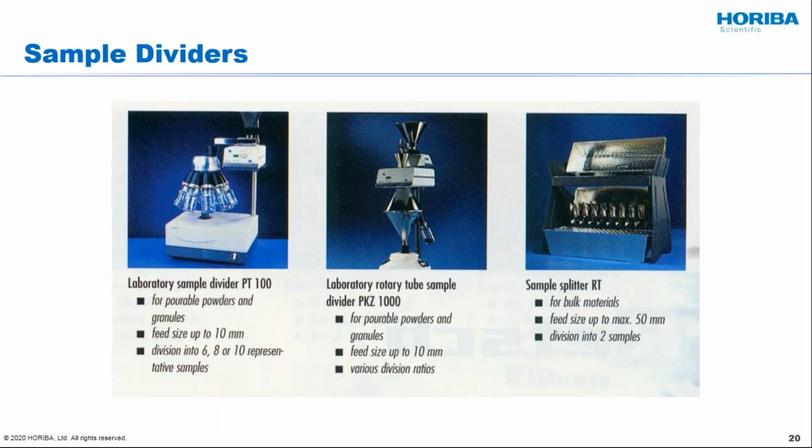So what you hope is that what you dumped in there, which is not homogeneous in most cases, you will get a little bit of each of the layers of the particles into each one of those bottles for further analysis. So again, lots of different ways to do this, lots of different types of instruments out there. But if you want to get repeatable data, you've got to be paying attention to this, or you're just going to get what was on the scoop rather than something that really represents what was in the entire drum.